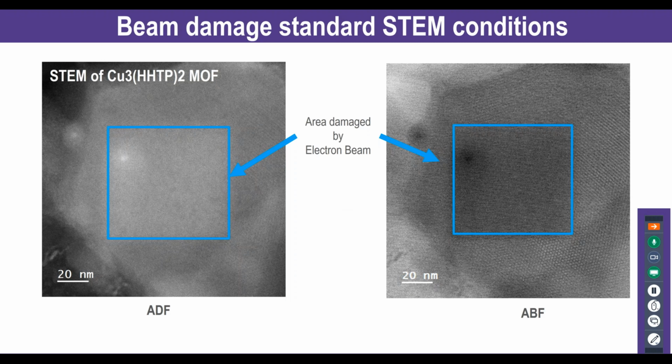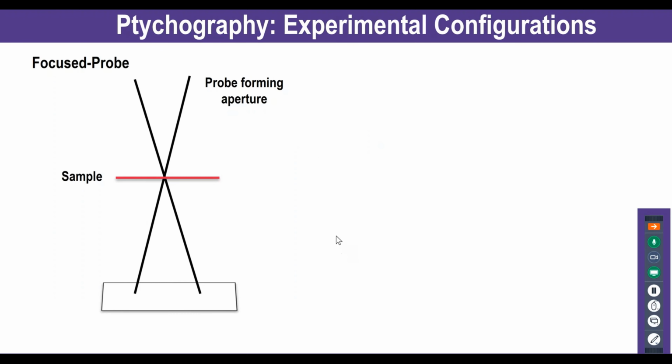And so to be able to image them and to do STEM, you do need those efficient methods here. And then there are other imaging methods, STEM phase images here. I want to talk specifically about ptychography. And then specifically within ptychography and electron ptychography, of course, two modes, right? One is a focused probe, where your sample is placed exactly where your probe is focused.